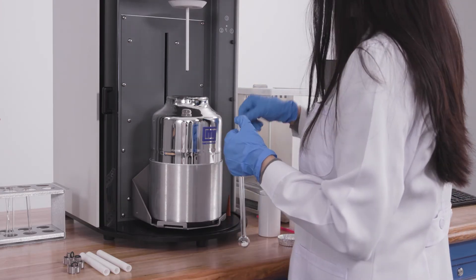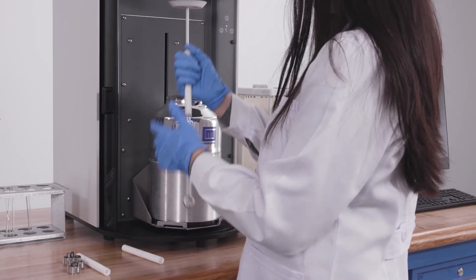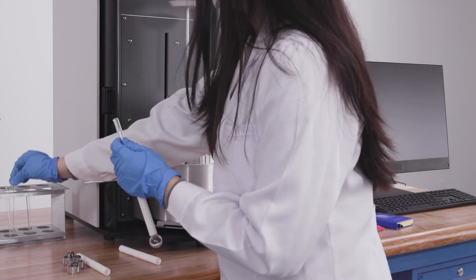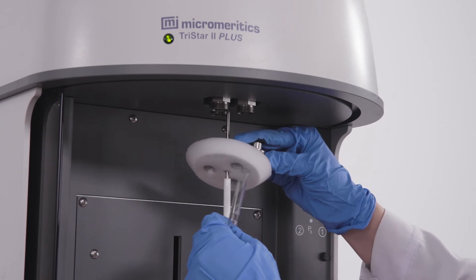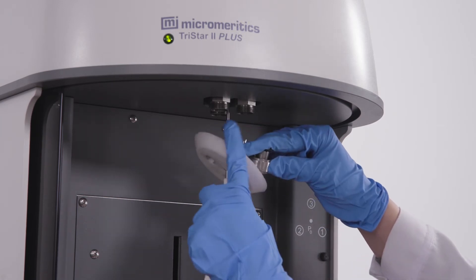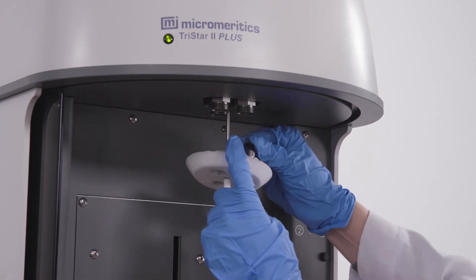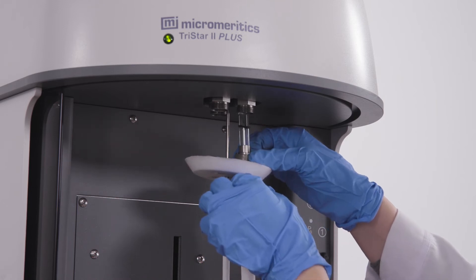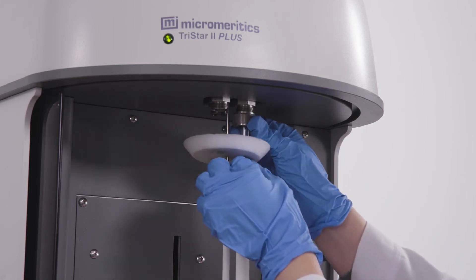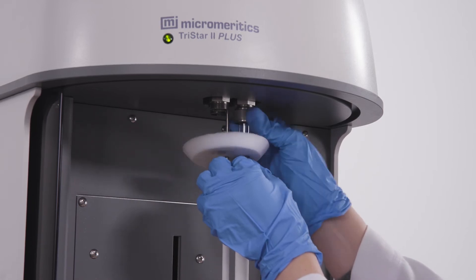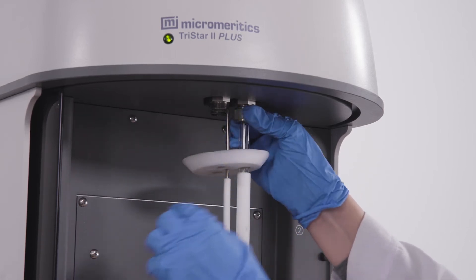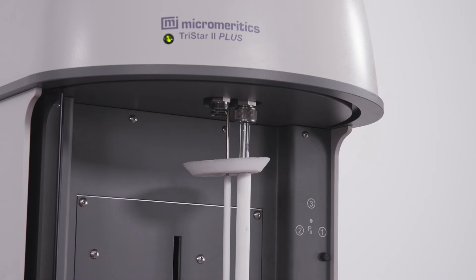Remove the rubber stopper and carefully slide the hanging filler rod into the tube and the isothermal jacket onto the tube. Push the tube through the dewar cover. Then slide the nut, ferrule, and o-ring on the tube. Tighten the nuts until they are finger tight. Close the sliding door.